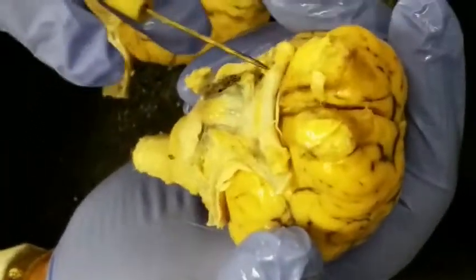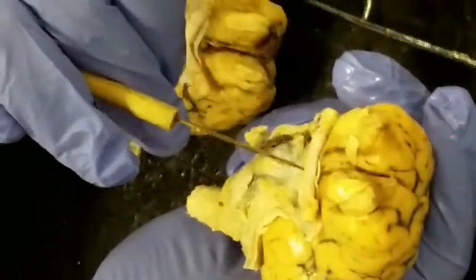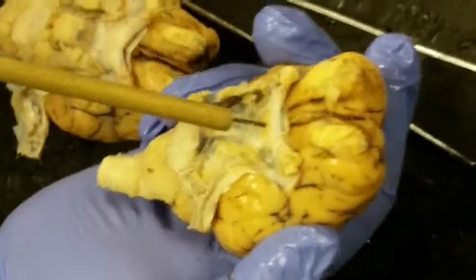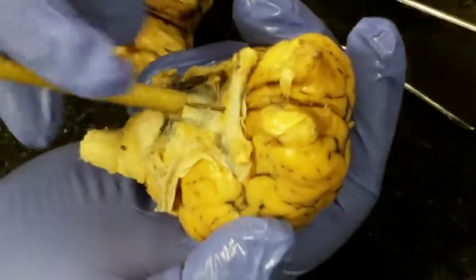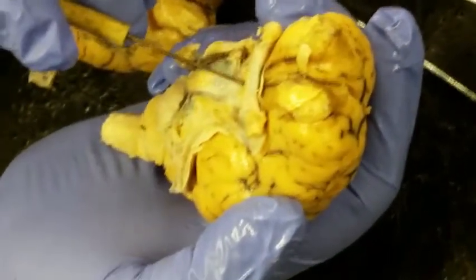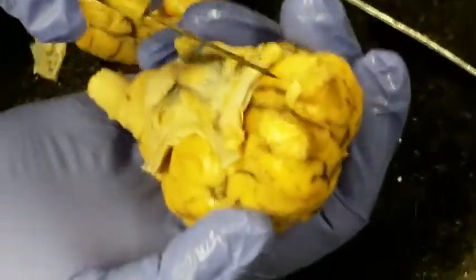Now you can see these. What are these? Olfactory nerves. Optic nerves. And in the center, the optic chiasma. One optic nerve, the second optic nerve, they meet right there. They're supposed to cross over. That's the crossover point, the optic chiasma.